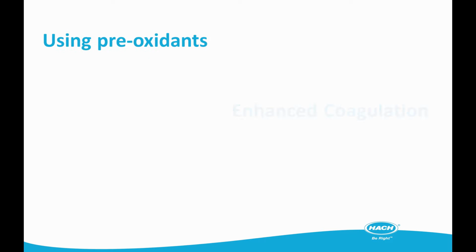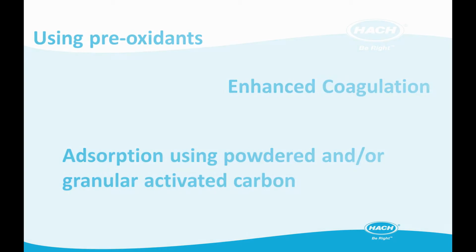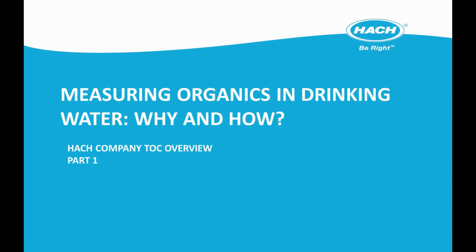Are you following any of these processes? If you answered yes to any of these, then measuring organics should be an important piece of that process. TOC Overview Part 1: Measuring Organics in Drinking Water. Why is it important?